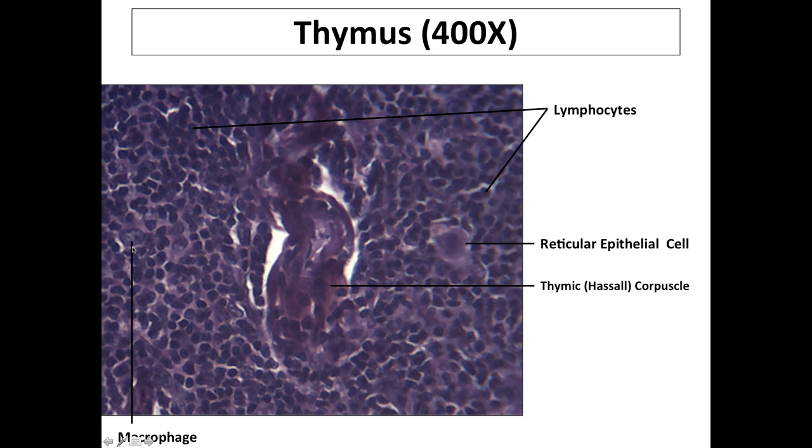You'll also see a handful here of macrophages. Macrophages tend to have this nice oval shape. You can see another one right through there. Their cytoplasm stains more lightly than the lymphocytes will, and they tend to have this teeny tiny little dark nucleus. Macrophages are phagocytic cells, and they can eliminate some of the pathogens or the debris of dying cells from this tissue.